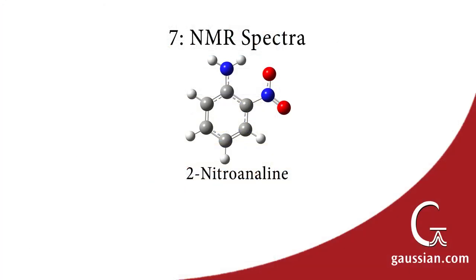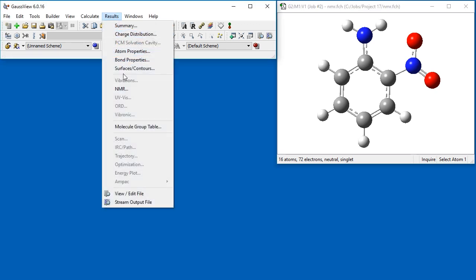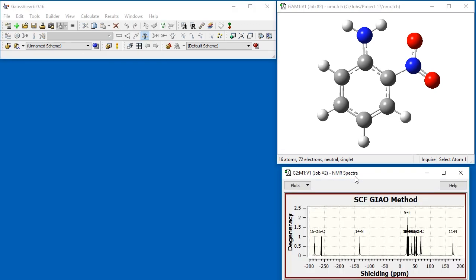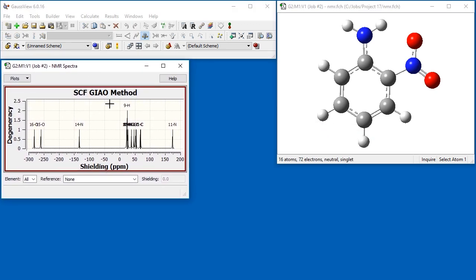GaussView includes a full-featured facility for examining the results of NMR calculations. We will demonstrate them for 2-nitroaniline. We've already opened the checkpoint file from the NMR calculation. Selecting NMR from the Results menu opens the NMR spectrum.